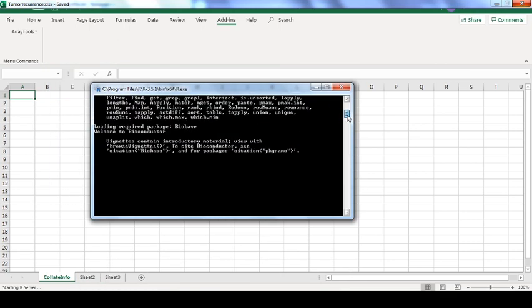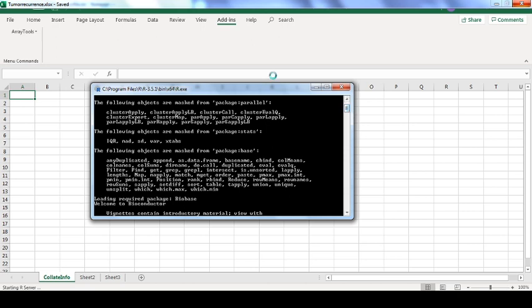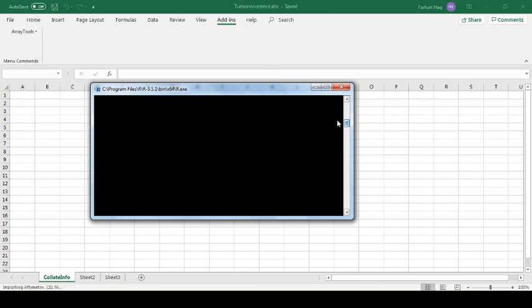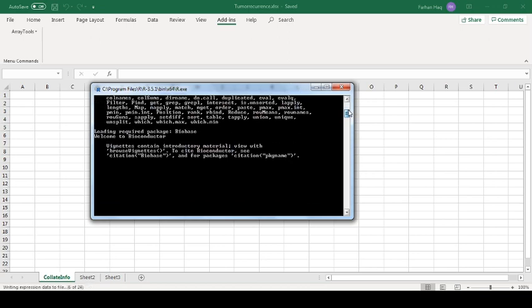One thing you should keep in mind: the first time you use the BRB Array tool, it will ask whether you want to install each missing package. You just have to click OK to all the packages it wants to install, so that it completes the whole process, and then it will perform the BRB analysis.